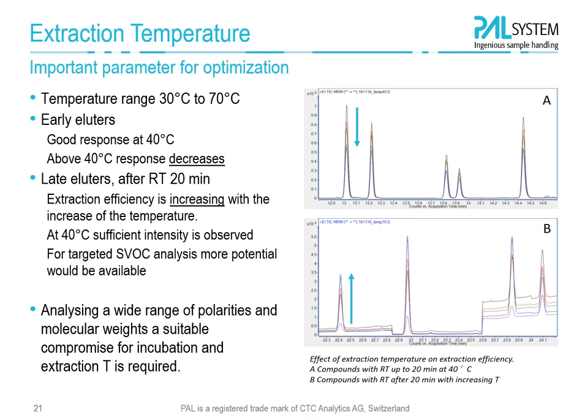So analyzing a wide range of polarities and molecular weights requires us to find a suitable compromise for the incubation temperature and also for the extraction temperature.